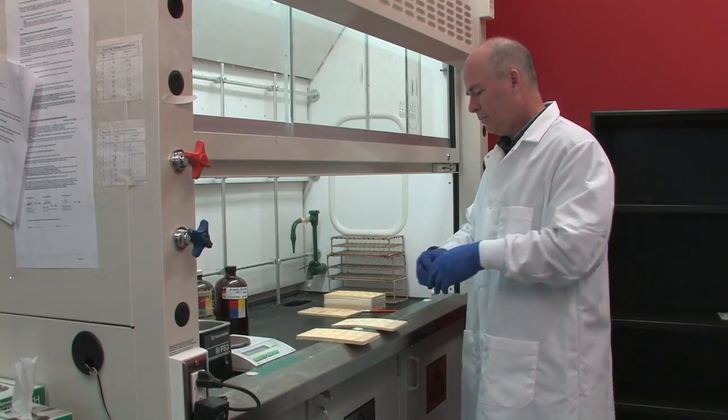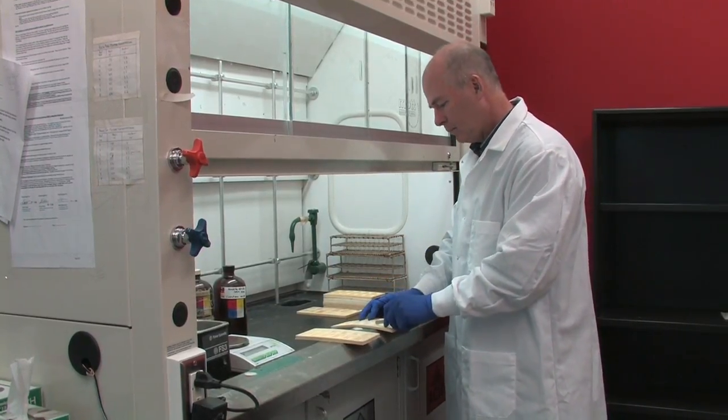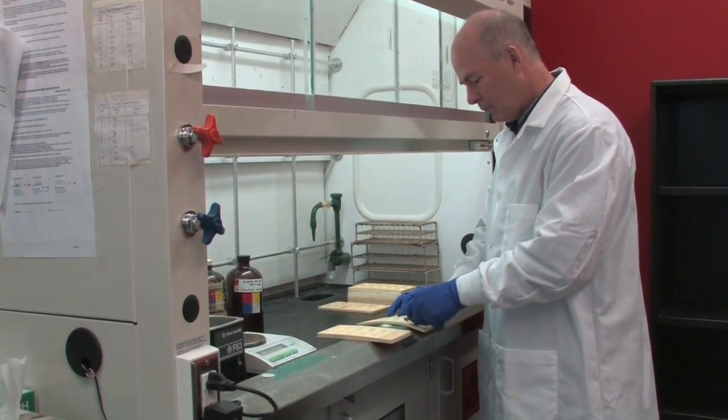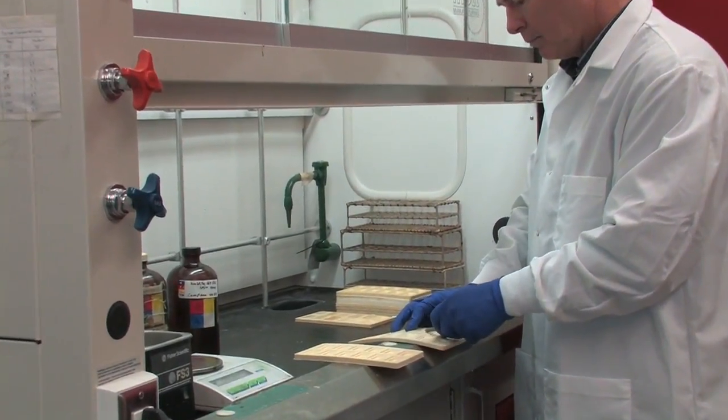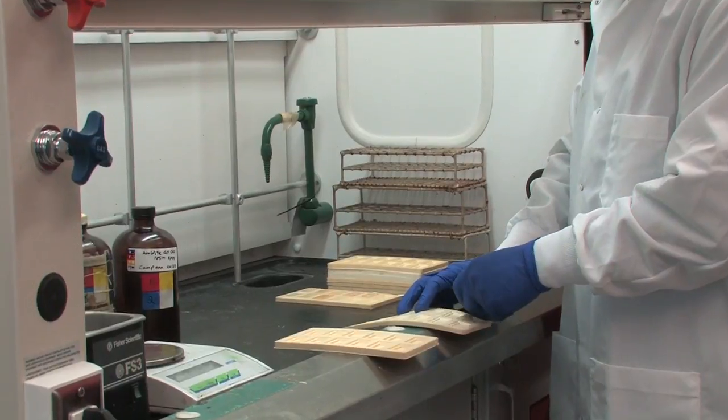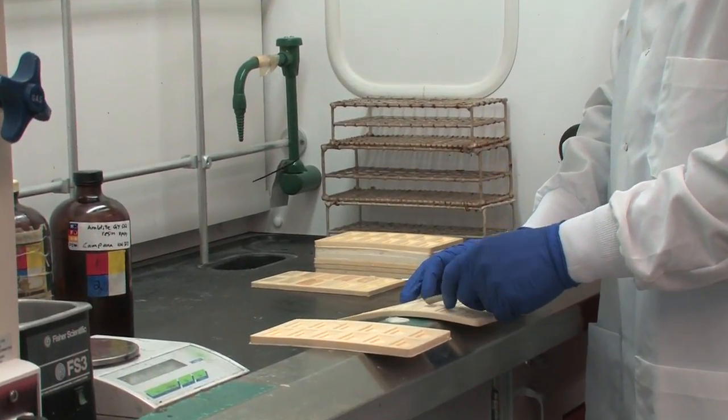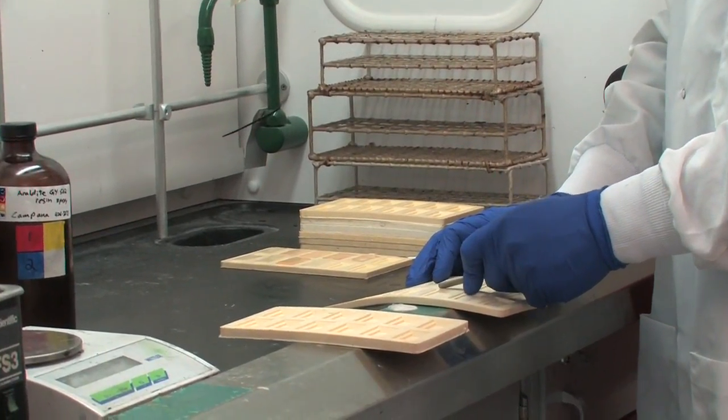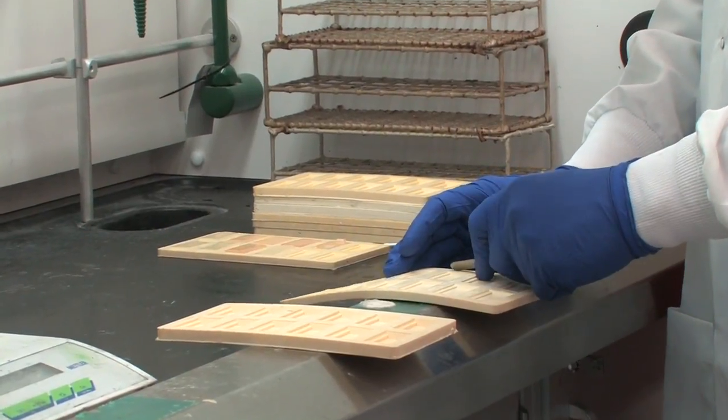The first step is to make sure the molds are clean and free of any old resin from previous pours. For this you can just use your fingernail or any small tool to scrape off the old dried resin.